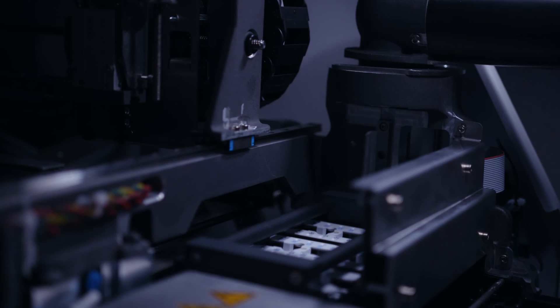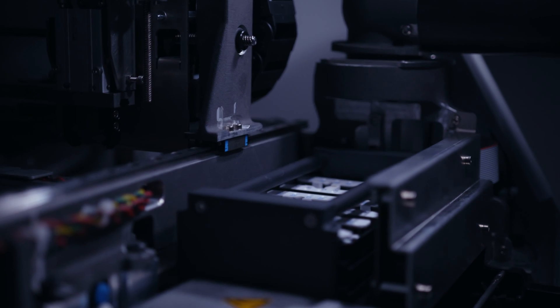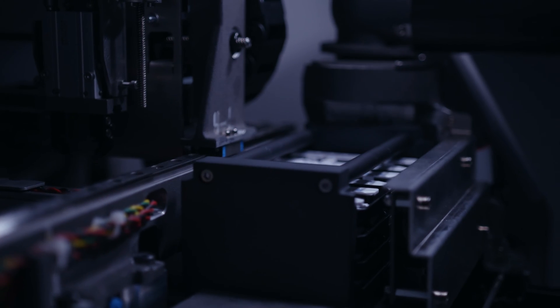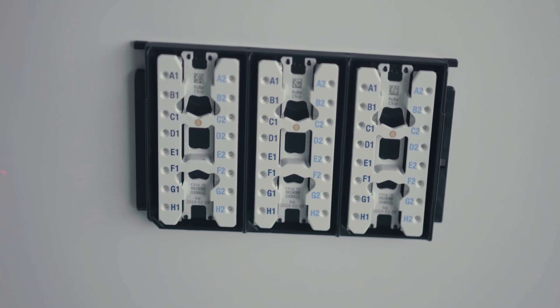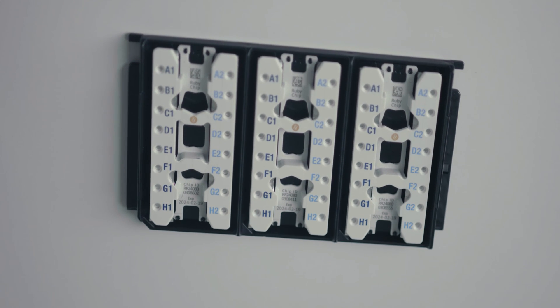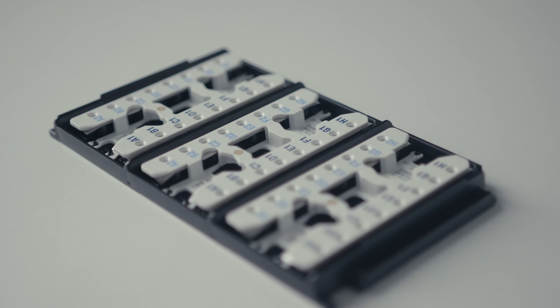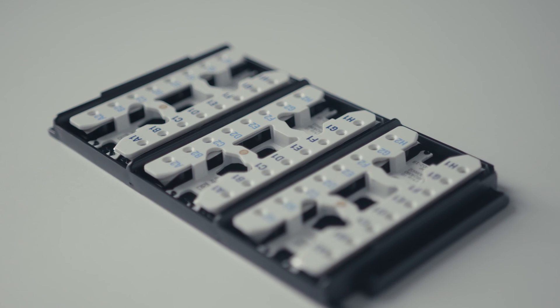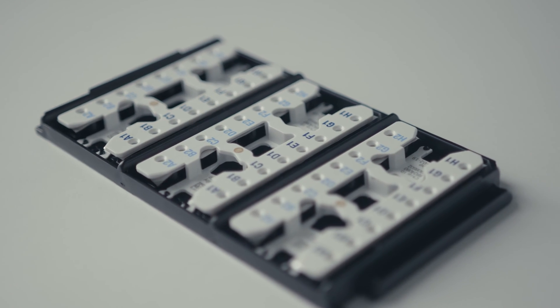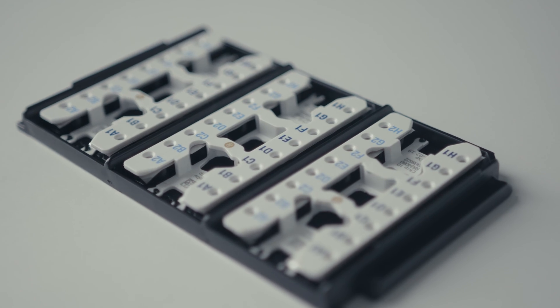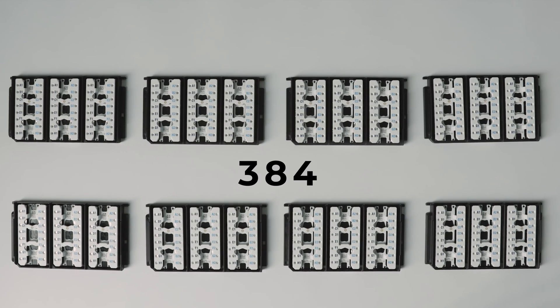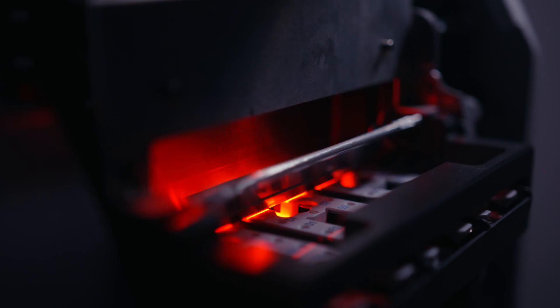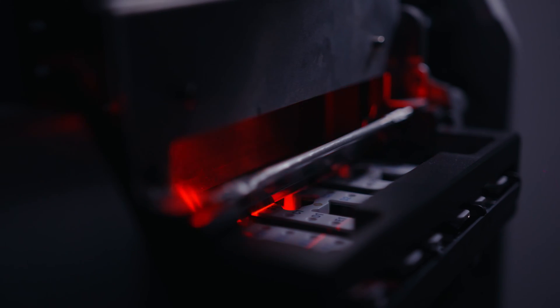All on a single instrument. NIYO Plus holds up to eight chip plates, a single chip plate holds up to three chips, and one chip holds 16 samples. That's exactly 384 samples worth of flexibility for you.